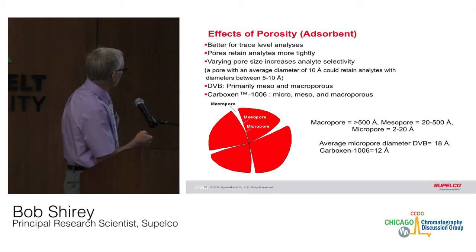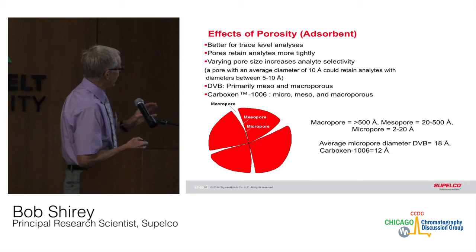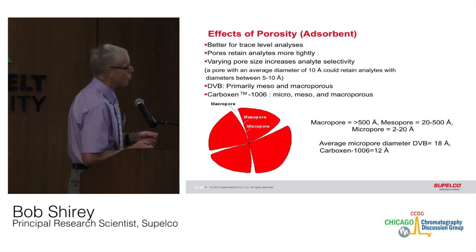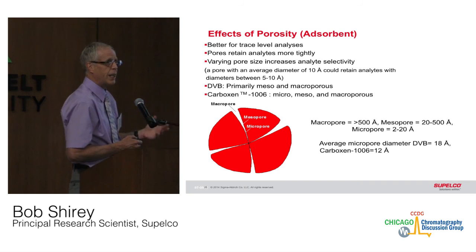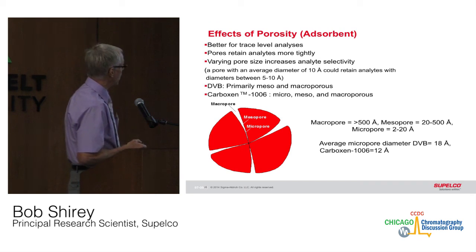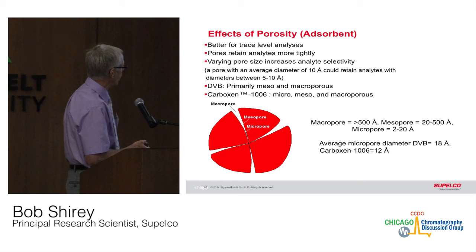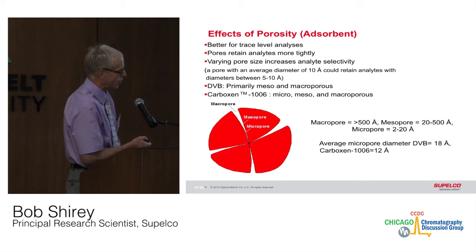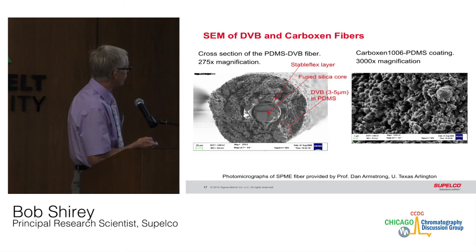Effects of porosity: it's better for trace level analysis. The pores retain the analytes more tightly. Varying the pore size improves selectivity. A pore that's about 10 angstroms in diameter can retain a 5 angstrom size molecule. Divinylbenzene has primarily larger pores, where Carboxen is a mixture of all 3, but has a high degree of microporosity.